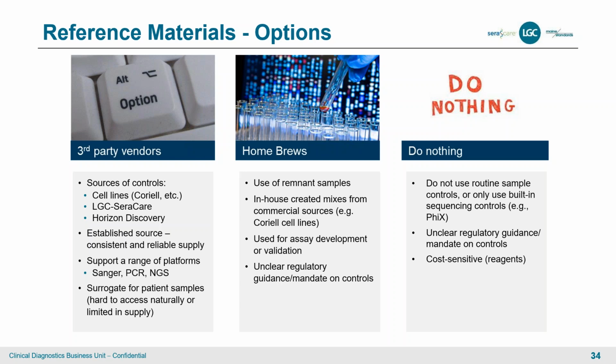And then what we call the do nothing option. Again, it's hard to admit that sometimes we don't routinely do QC. There are a lot of labs that are not using it routinely. They may use it for validation, but not for routine QC. They may only use built-in sequencing controls, which really doesn't give you the power information we just talked about in the last 20 minutes.